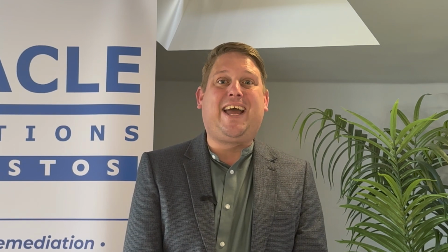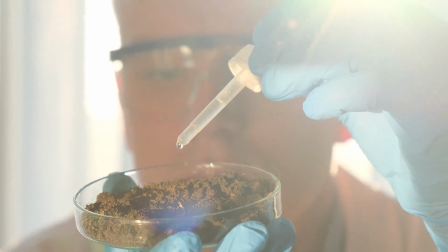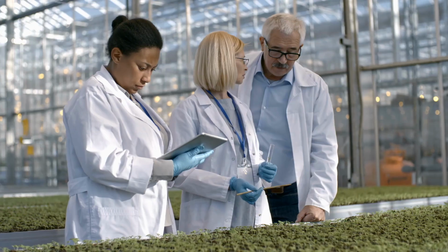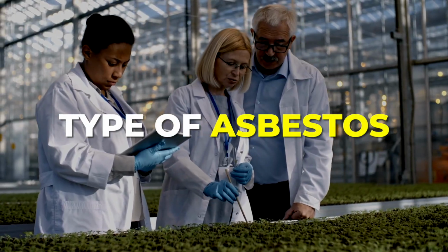Each sample area requires careful visual inspection to note any visible asbestos materials, which are collected separately before excavating soil samples ready for laboratory analysis. The samples, along with any suspected asbestos fragments, are then sealed in individually labelled containers and sent to the lab, where they undergo detailed testing to confirm the presence and type of asbestos.